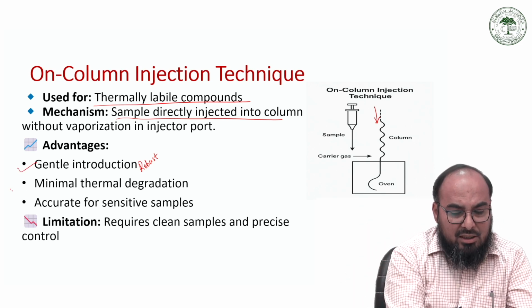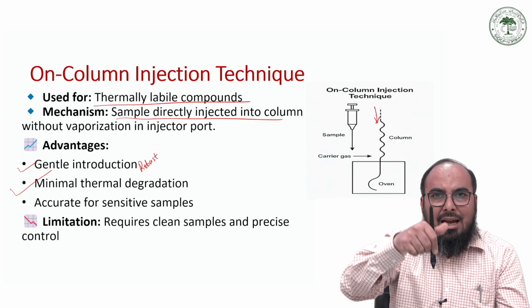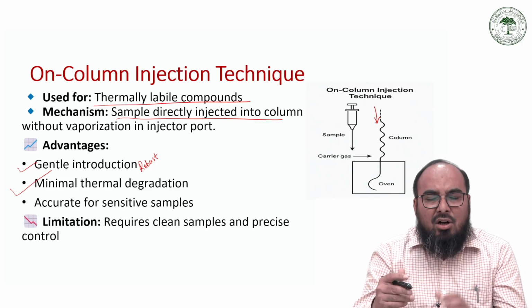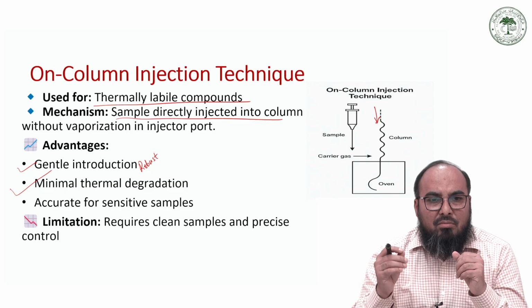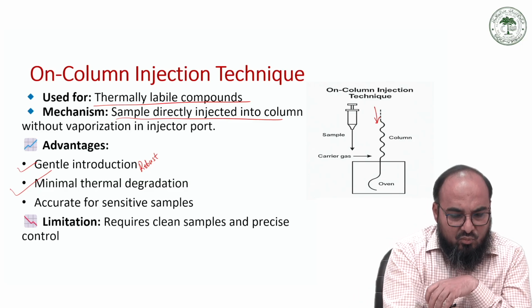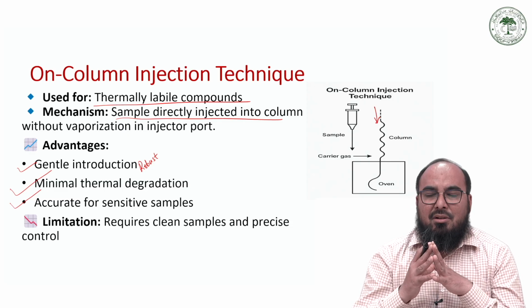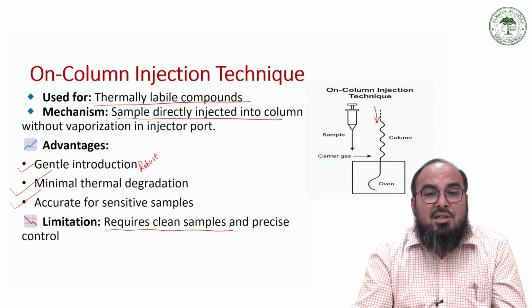Again, you have minimal thermal degradation because your sample is not getting decomposed, as it does not have to stay in any port or experience the high temperature. Because it goes straight, it has very little travel time, and it is accurate for sensitive samples. So there are limitations, and one major limitation is that you require clean samples.